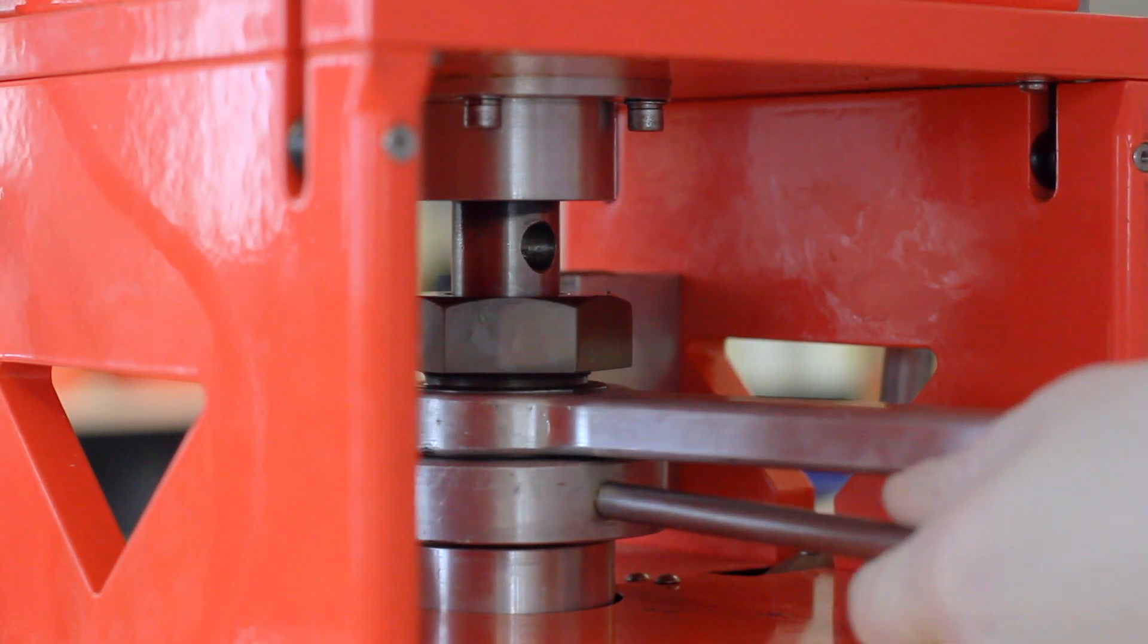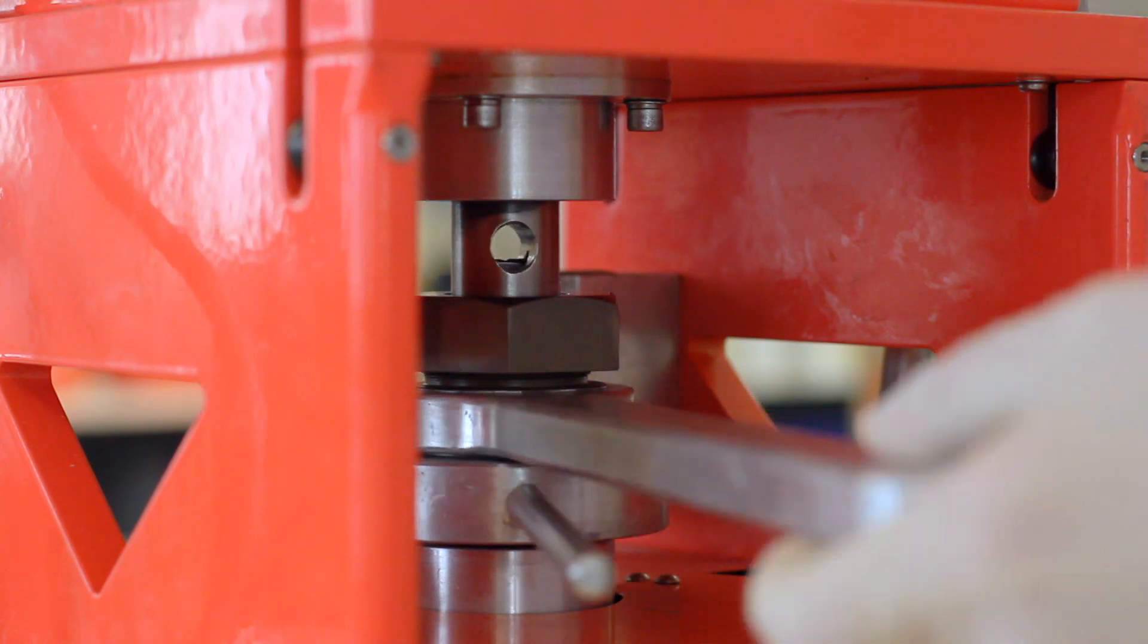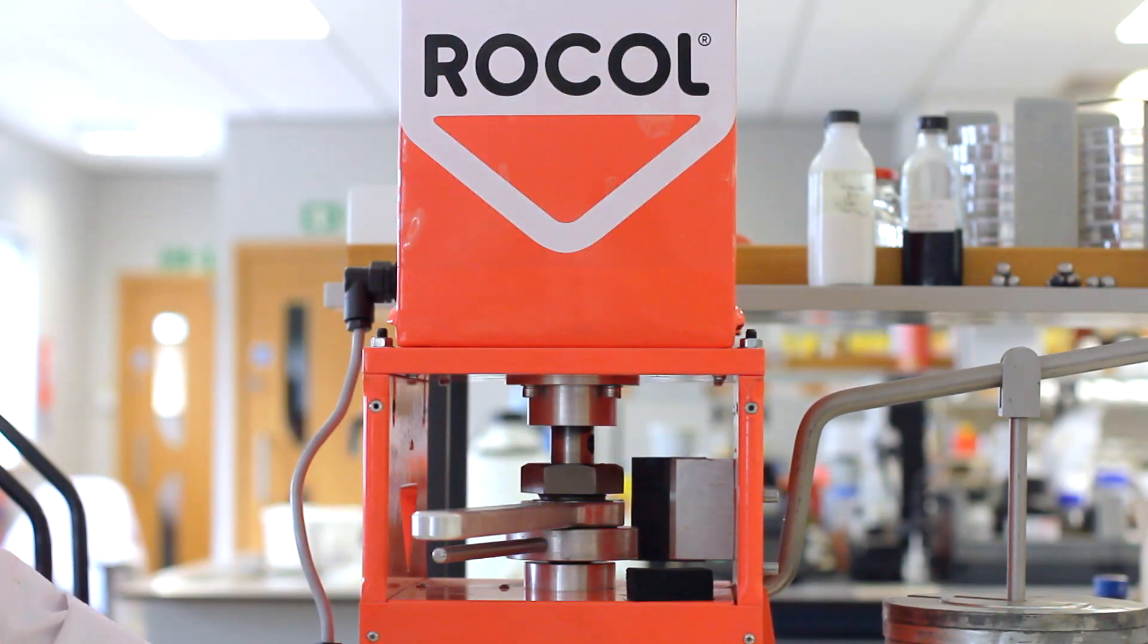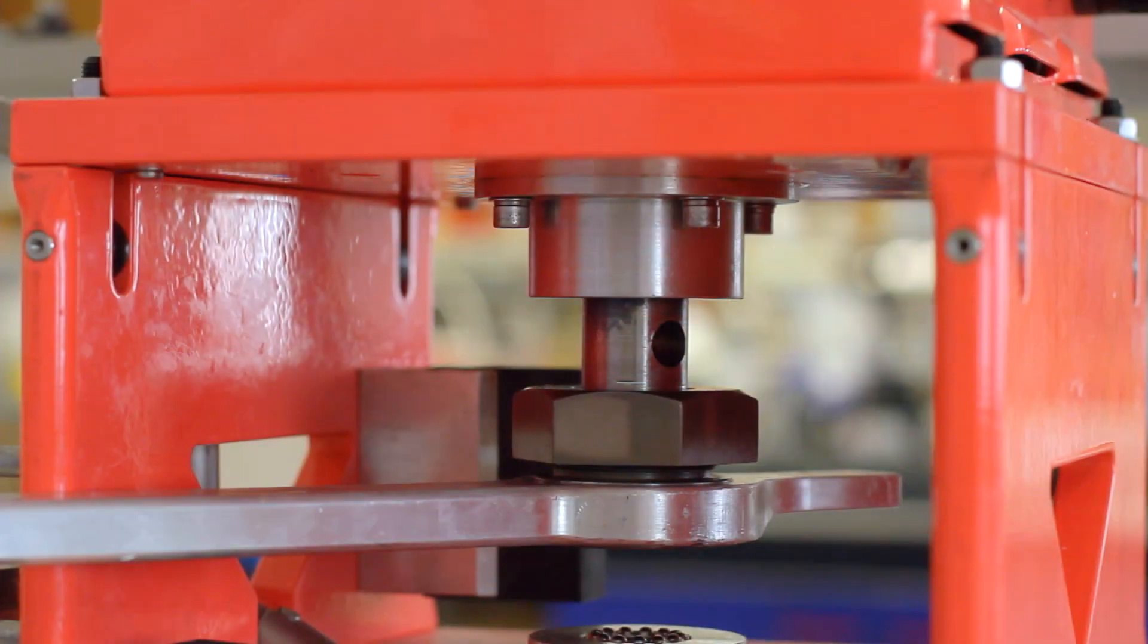The chuck rotates at 1500 rpm. After a few seconds the machine stops because the four balls inside the mechanism are welded as you can see once you release them.